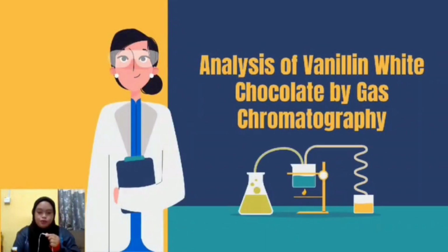For this video, we want to talk about the analysis of vanillin in white chocolate by gas chromatography.